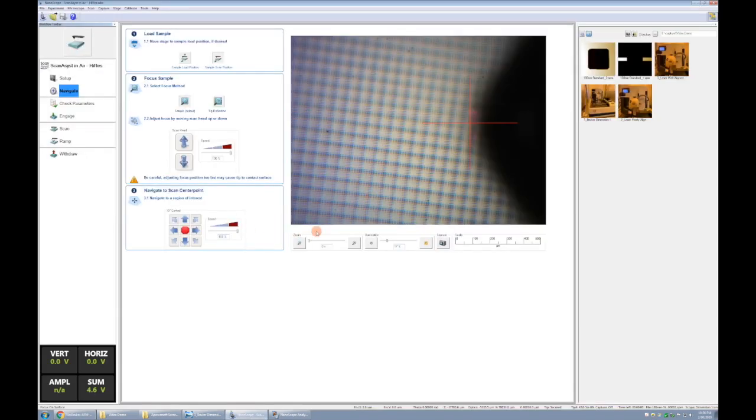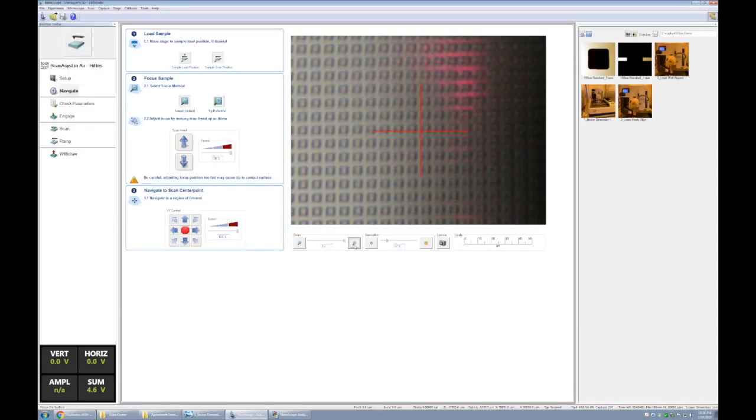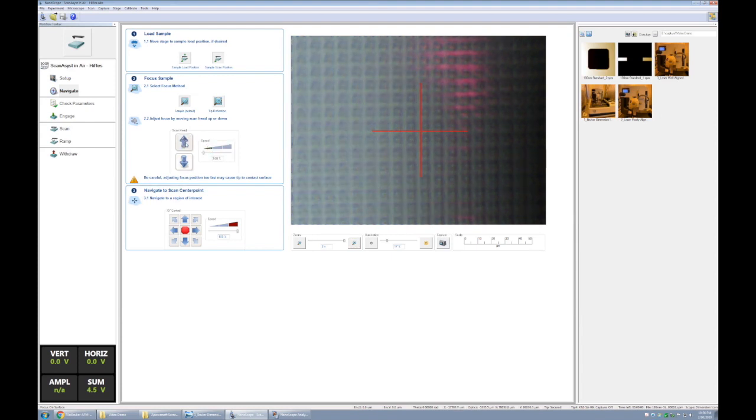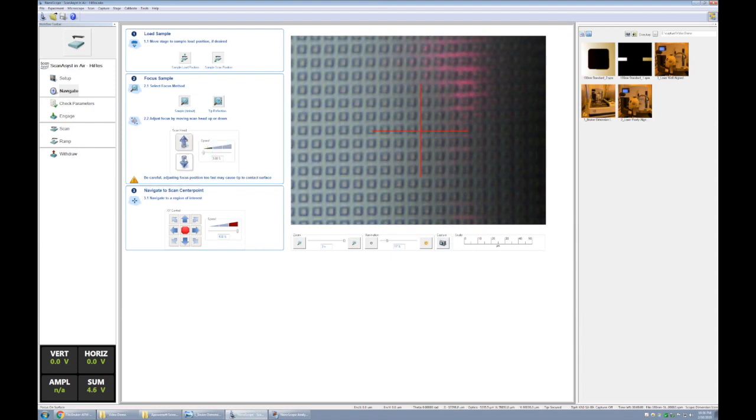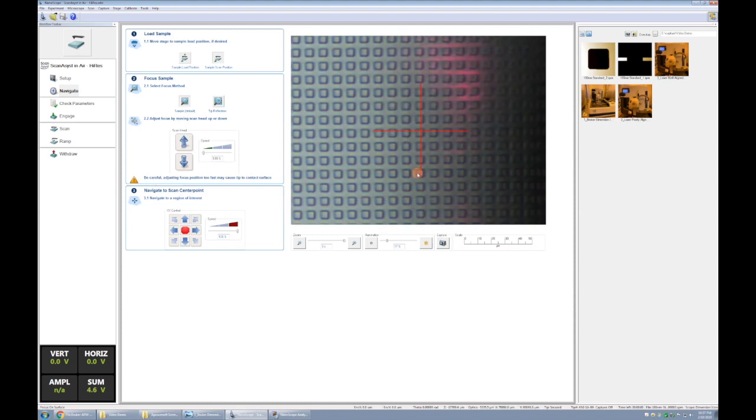If we digitally zoom in, we'll be able to see these squares. Now we can lower the scan speed as we move the scan head up and down. Once it's in focus, that means that our scanner is one millimeter above the sample surface. Once you have that, you can double click maybe on one of these squares, and that really ends our navigation. It's just a matter of getting the sample underneath the scanner and then lowering the scanner until our image is in focus.